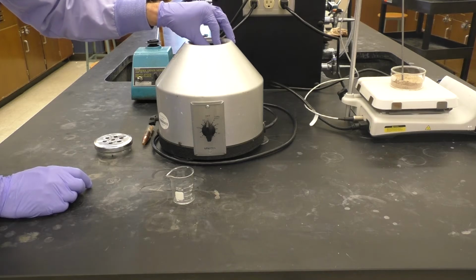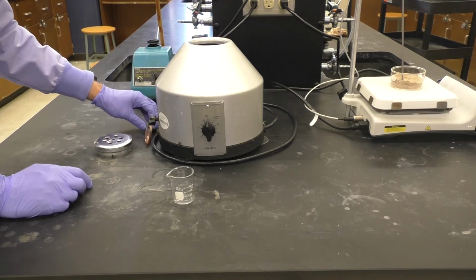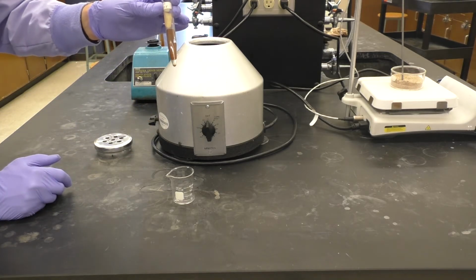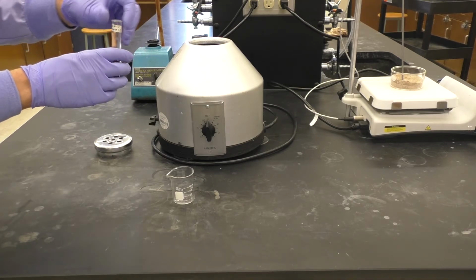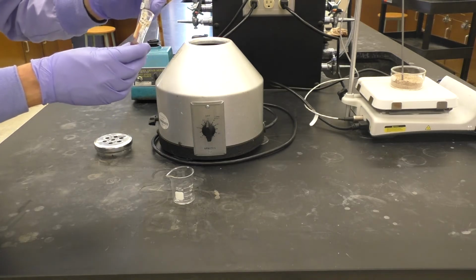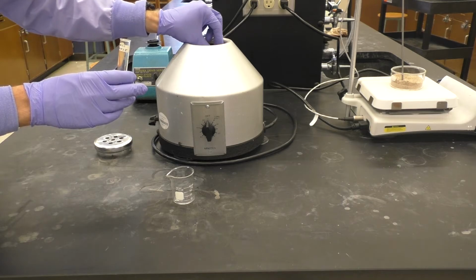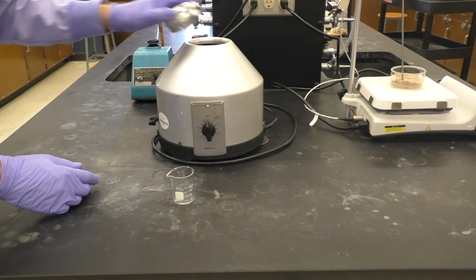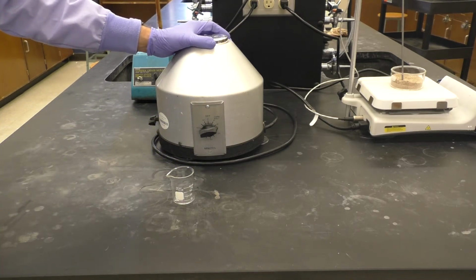Now, anytime you use a centrifuge, you need to make sure that the centrifuge is balanced. And so directly opposite that, I'm going to put something that's approximately the same weight. Here's another centrifuge tube with a couple corks that's approximately the same weight as the Craig tube with its plunger. I'll set that directly opposite it, close the centrifuge, and then simply turn it on and let it run for a little while.